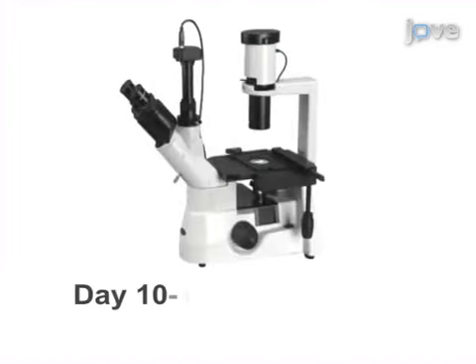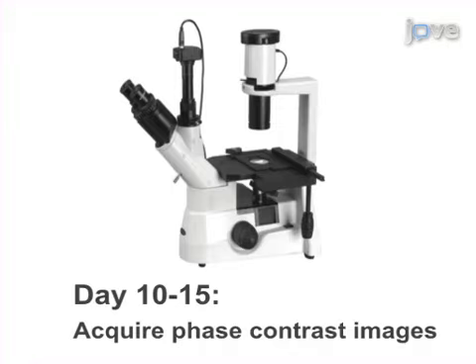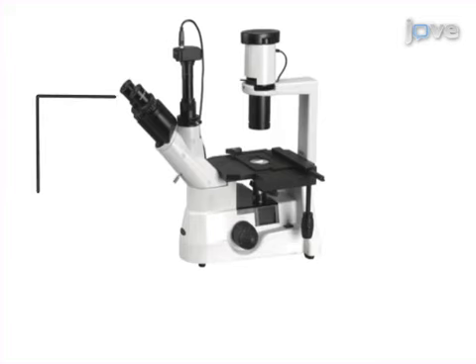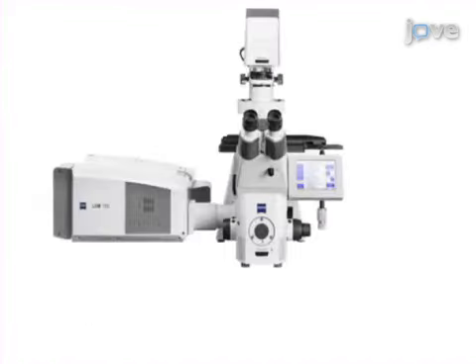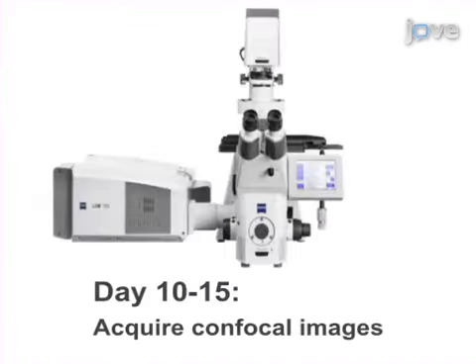Next, the phase contrast images of the acinar-like colonies grown in 3D are acquired at a 5x resolution. The final step is to process the acinar-like cultures for immunocytochemical analysis with relevant molecular markers, followed by the acquisition of confocal images of in situ immunostained acinar-like colonies at midsection.